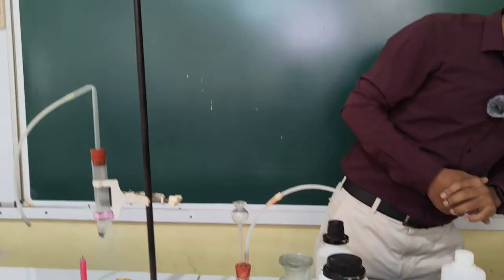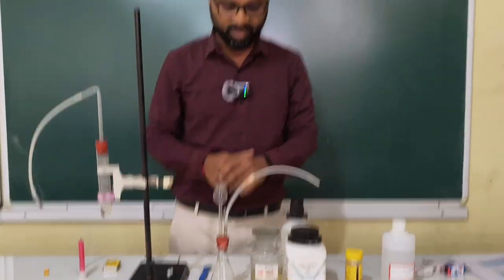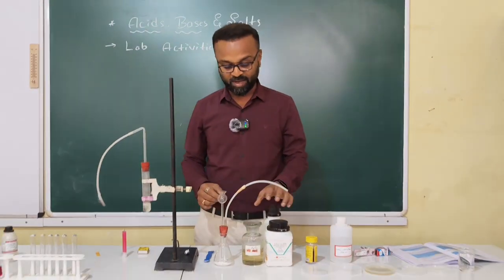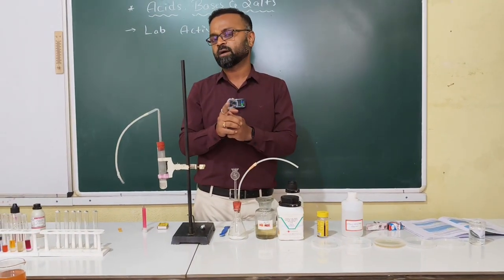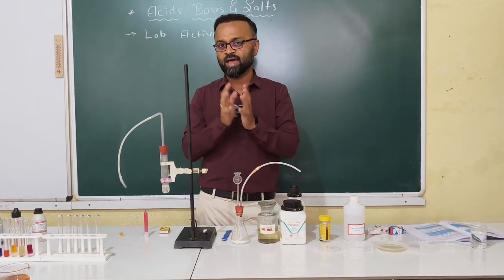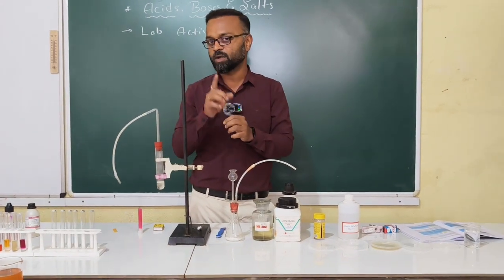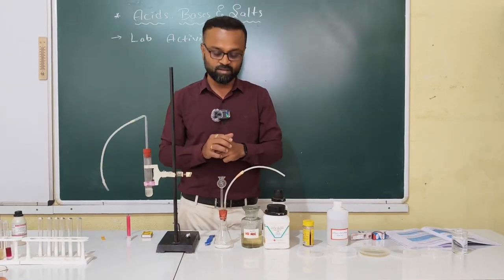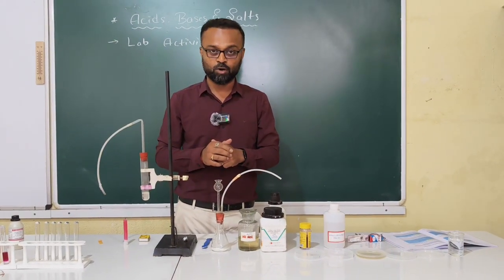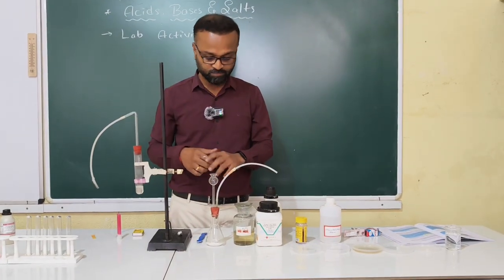The next one, you can see on page number 20, is the reaction of HCl or H2SO4 with sodium carbonate, which will liberate carbon dioxide gas. Any carbonate compound, when reacting with an acid, they will definitely ask a 1 mark question, and the gas liberated will always be carbon dioxide. Now today we are going to test whether the gas liberated is carbon dioxide or not by passing that carbon dioxide gas into lime water.